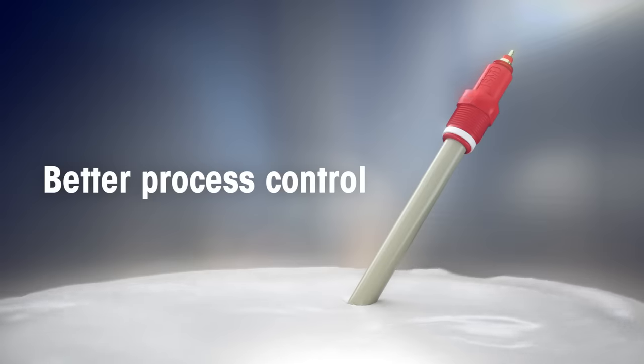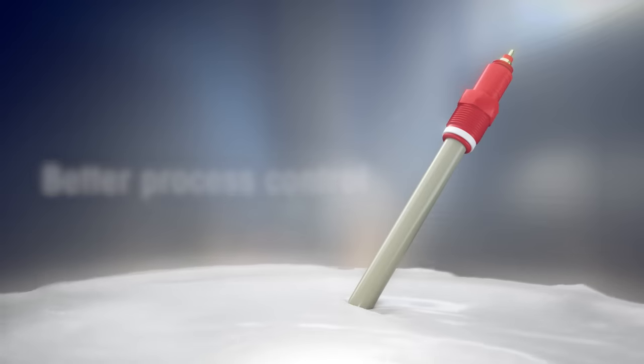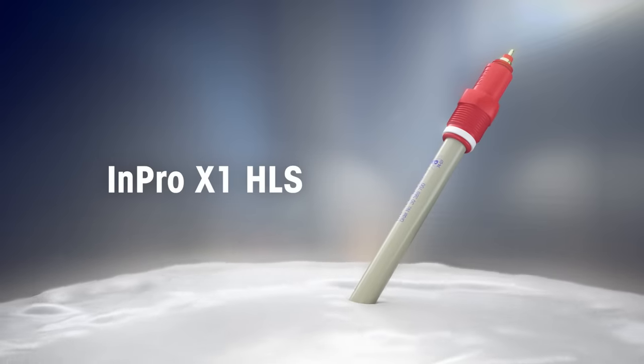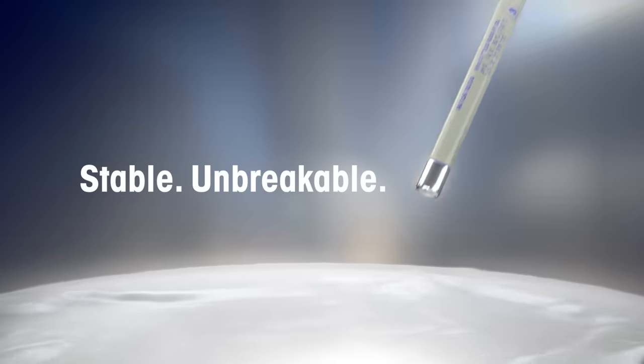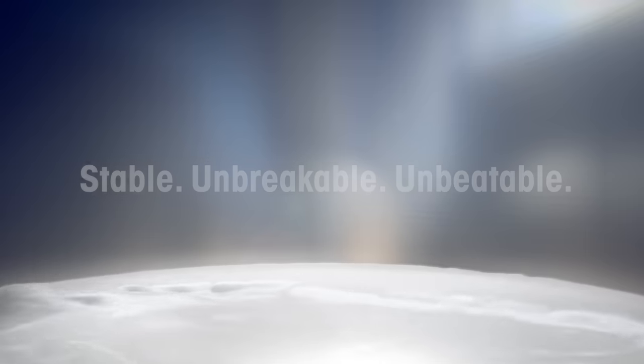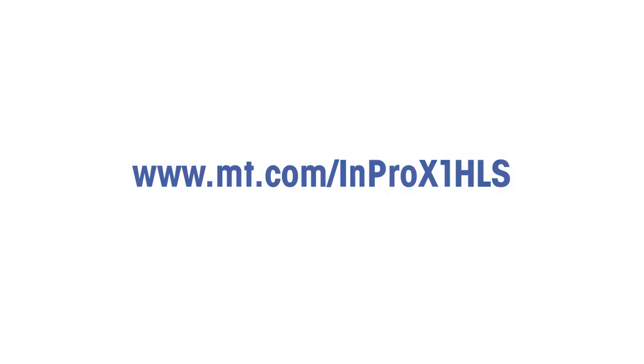The revolutionary InPro X1 HLS: food safe inline pH sensor—stable, unbreakable, unbeatable. For more information, please visit our website.